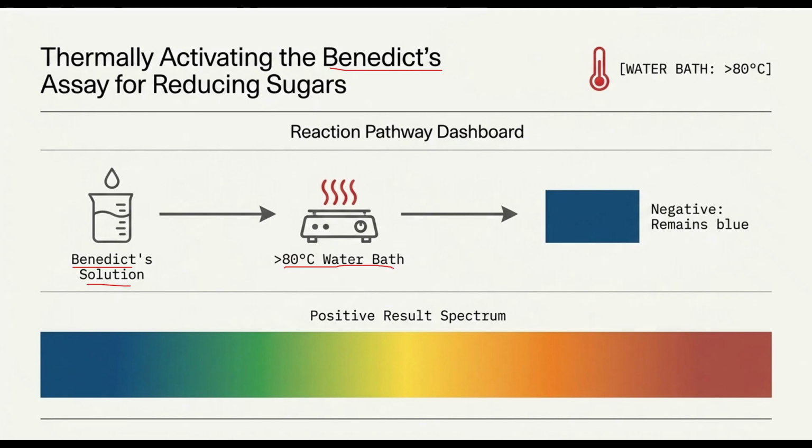Then, if reducing sugars are present, the solution changes color from blue to green. And what if there is no reducing sugar present?